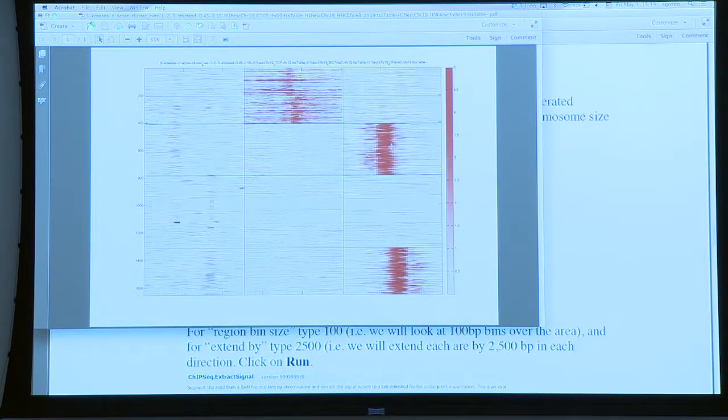So I think this is one thing that is really nice to see, how we can take many genomic areas of interest, let it be promoters or enhancers, and take our data and explore it over them. Or if someone asked me, how do we compare technical or biological replicates? It's nice to have biological replicates one next to the other, and this way you can look at many genomic areas and see how well they reproduce on, for instance, all the promoters and so on.